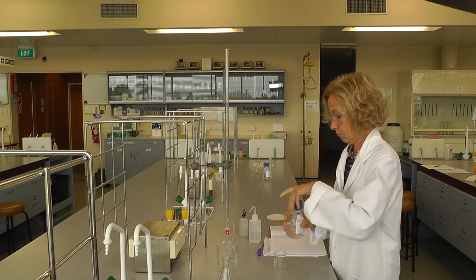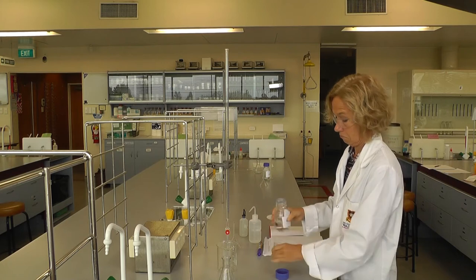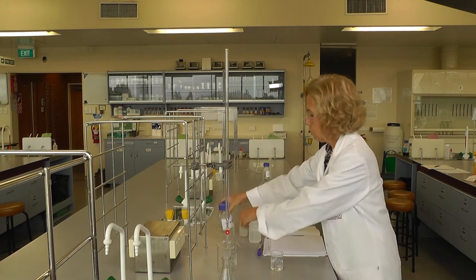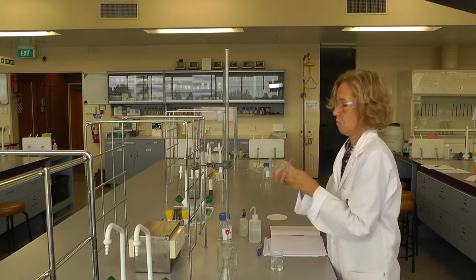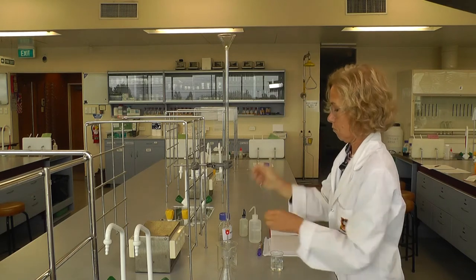The burette needs to be rinsed with stock solution, so pour some of this into a beaker. Put a funnel into the top of the burette and ensure the tap at the bottom is closed. It's a good idea to have a waste beaker underneath the burette during this process.